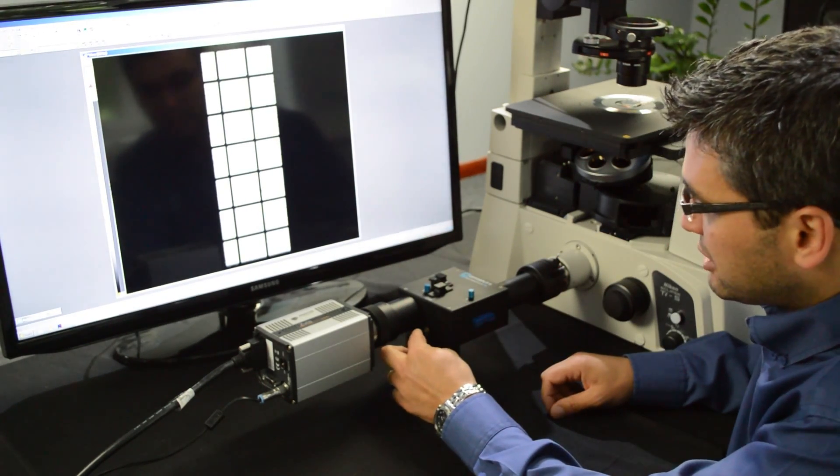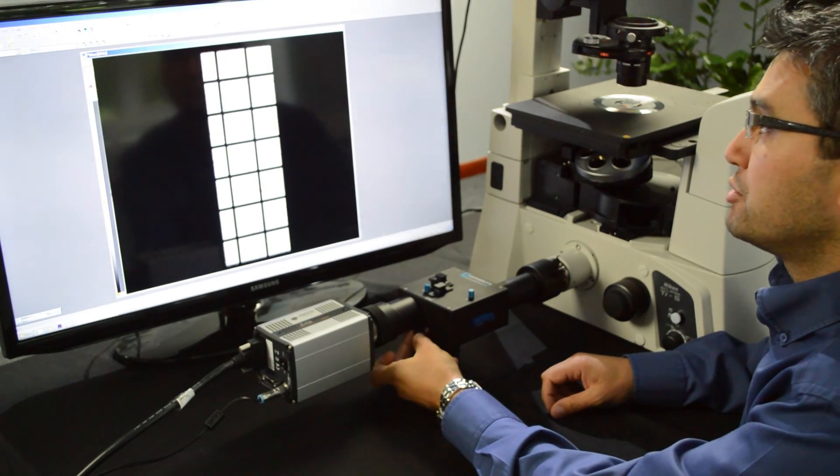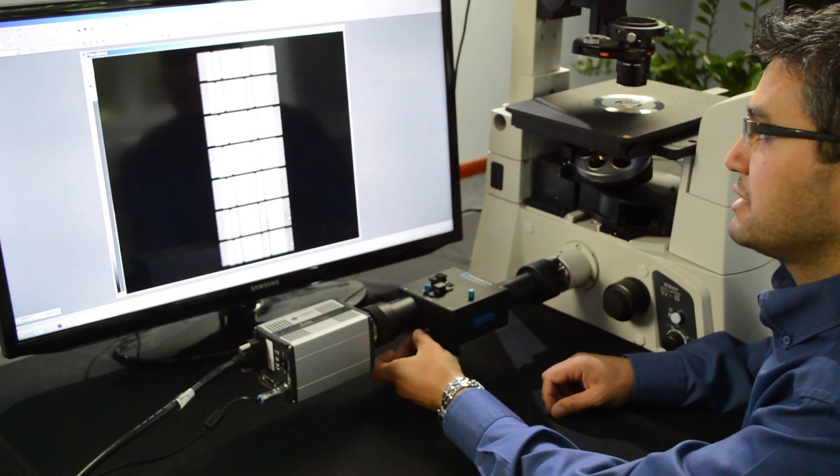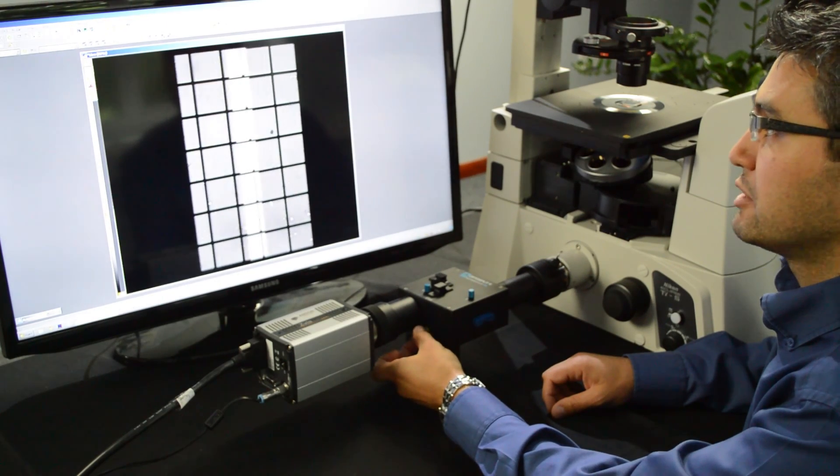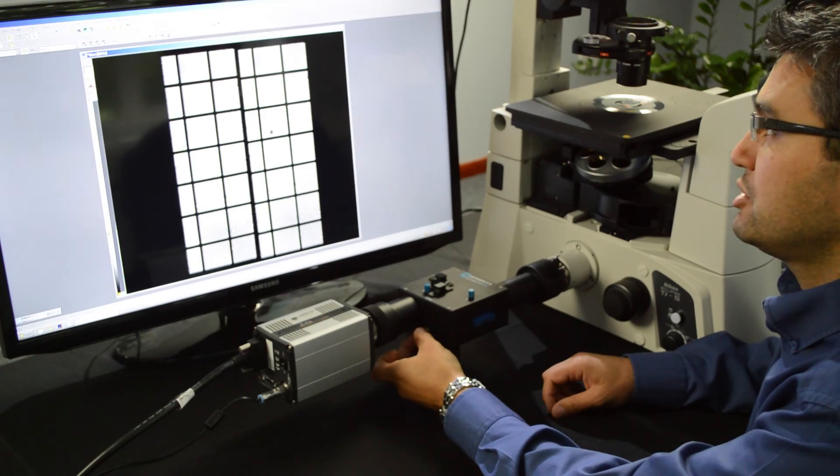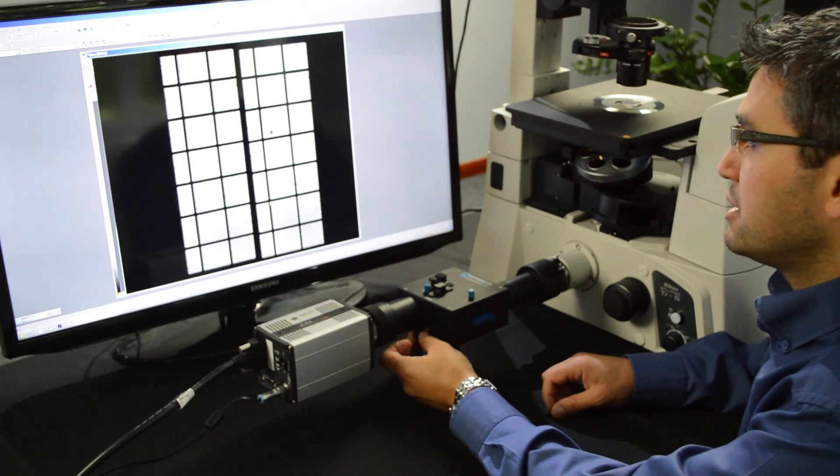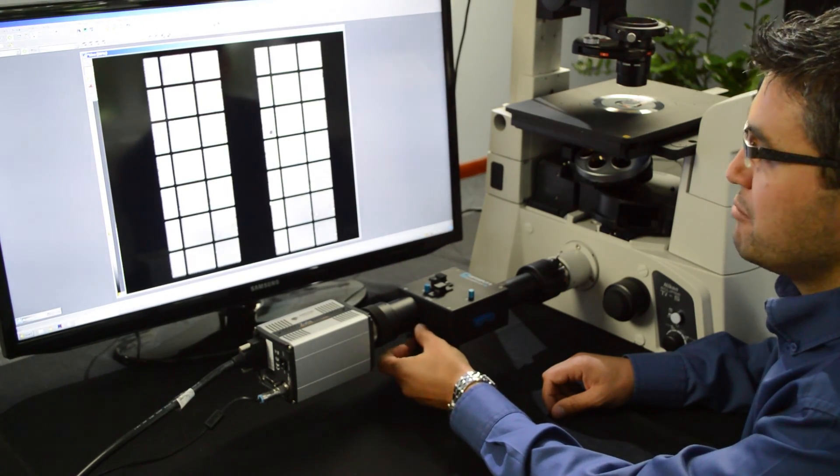You then use the split control and you rotate it anti-clockwise and that's important to rotate it anti-clockwise because if you do the other way around you'll get more optical aberration. And if you rotate it anti-clockwise to separate both emissions.